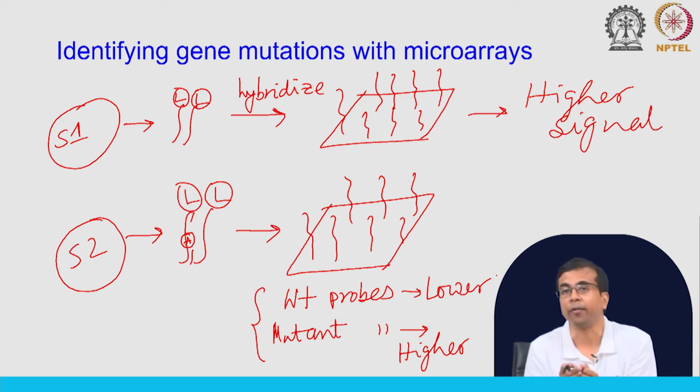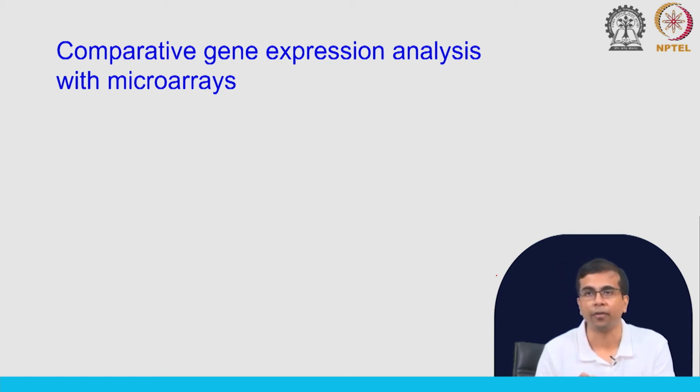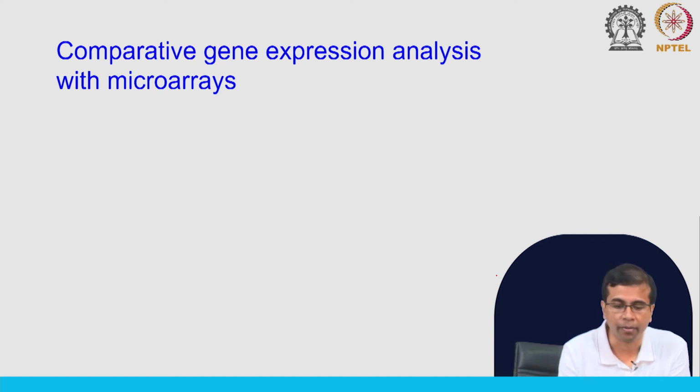So, in this way you can take a guess and you can design probes that will help you identify gene mutations or genotype. So, this is what researchers did with microarray technology. You can also study gene expression using these microarrays. Okay. So, we will illustrate this very briefly.